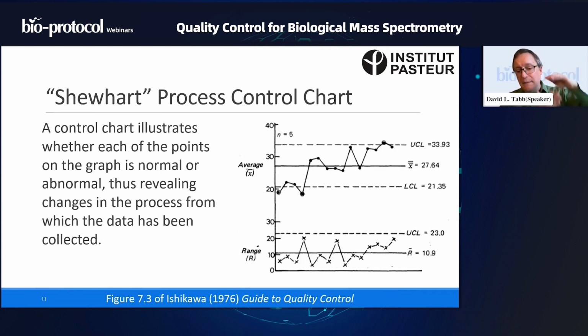On the other hand, I might have had 5 QC experiments that have a very sizable difference between the highest value observed and the lowest value observed, in which case the range is really big. So in a case like that, from the average, I might think I was doing fine, but the variability I observed, the range that is incurred, is very great.